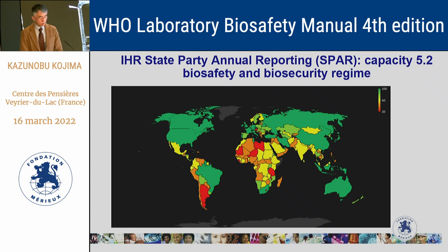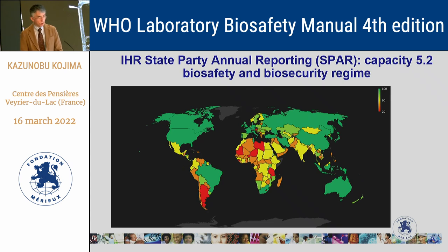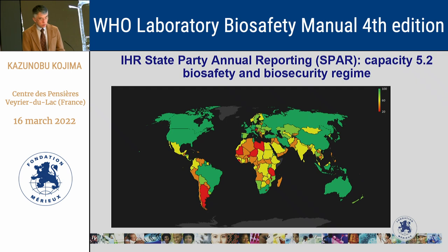This global map outlines biosafety and biosecurity regime achievement. This is based on IHR — International Health Regulations — state parties' annual self-reporting about biosafety and biosecurity. The map shows that some countries have made good achievements, but unfortunately, mostly resource-limited countries are still struggling to achieve and maintain a good biosafety and biosecurity regime. That is the reality.